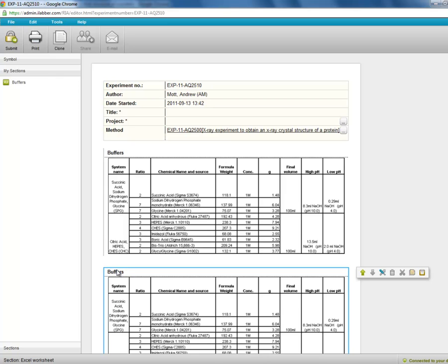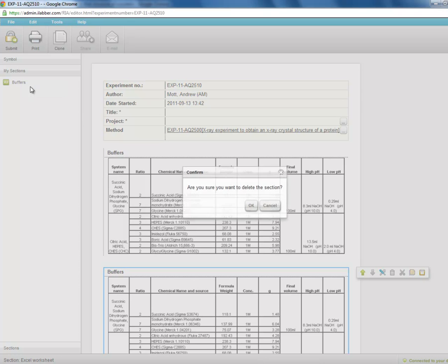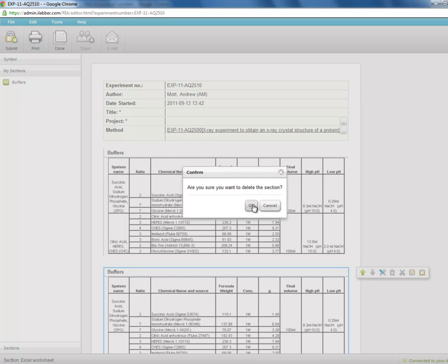If you no longer need these, you can of course delete them by right clicking and going delete. And then it will be deleted from your my sections toolbox. So try and use these features to save time writing up your experiments.